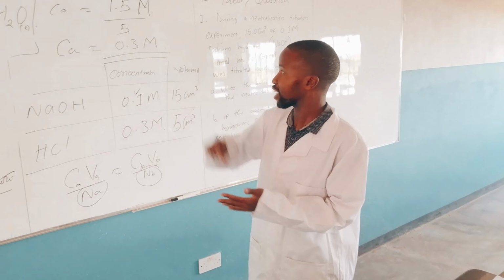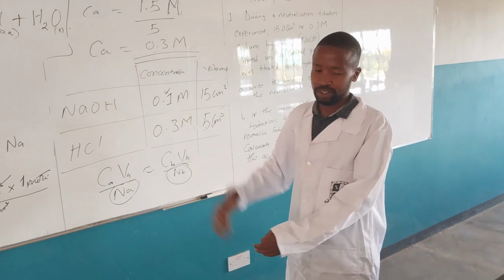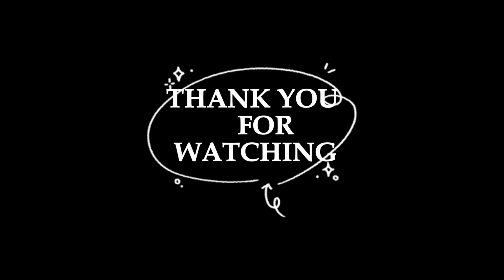That's how we work out an acid-base titration question if we do the practical session.